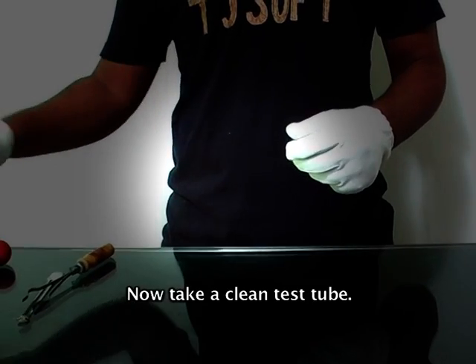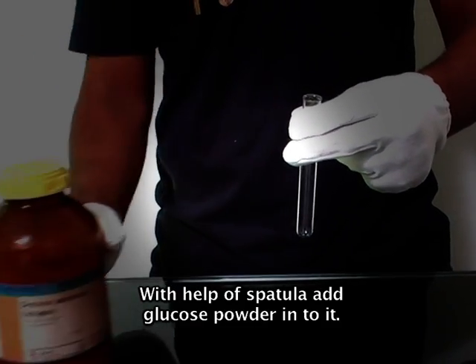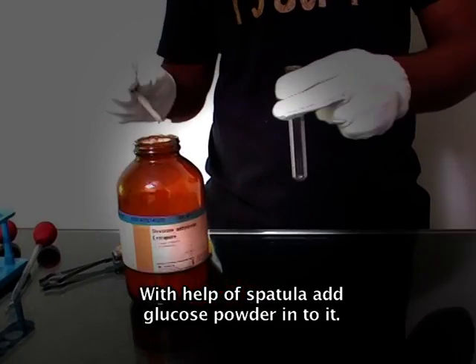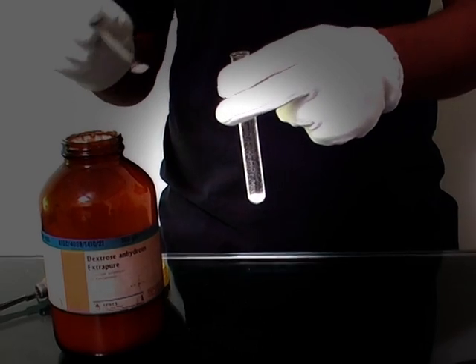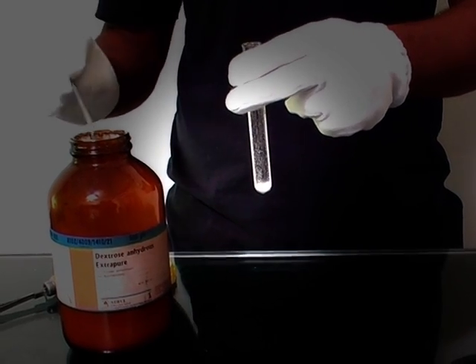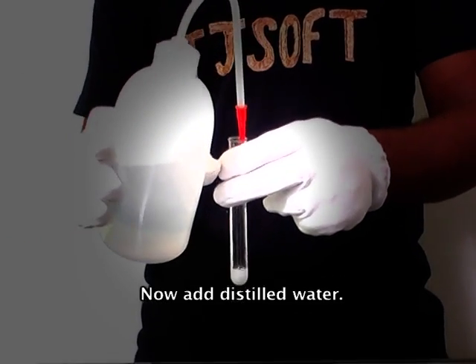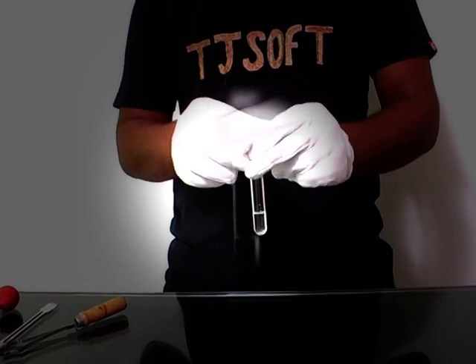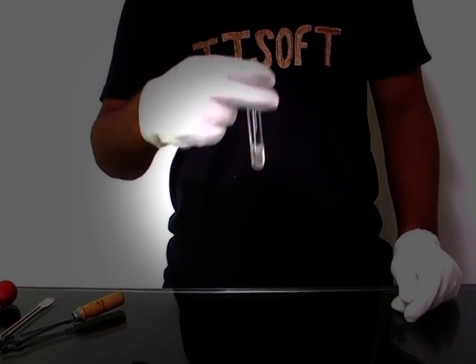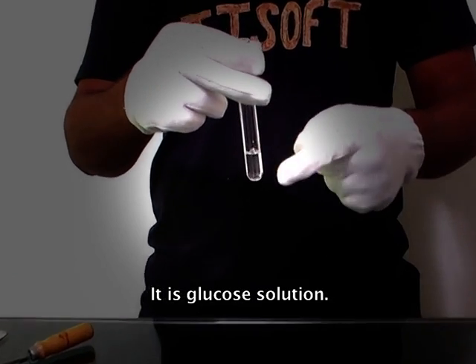Now take a clean test tube. With the help of a spatula, add glucose powder into it. Now add distilled water and shake it well. It is glucose solution.